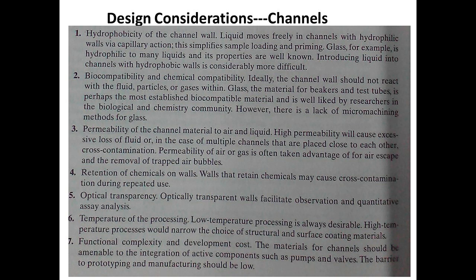For the first point, how hydrophobic is the channel wall? If the liquid moves freely in the channel, it means that it is a hydrophilic wall. So it is good, because you can have good sample loading. It is easy for you to transport the liquid. If the wall is hydrophobic, it is much harder for the liquid to move.